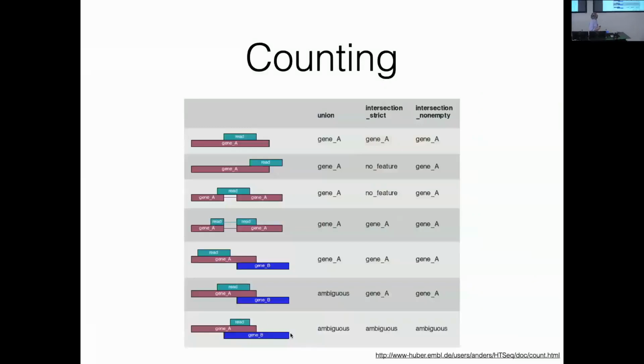Of course, it's never quite so simple. Here is showing a couple of pathological examples. So here's what you're normally hoping for, right? This is the gene, and you have a read falling totally within the gene, but you get weird stuff like a read, well, it isn't super weird, but the read is partially in the gene, partially not. Here is a read that spans an intron, which, you know, for RNA-seq maybe doesn't make sense. Here's a read that's spliced just like it should be.